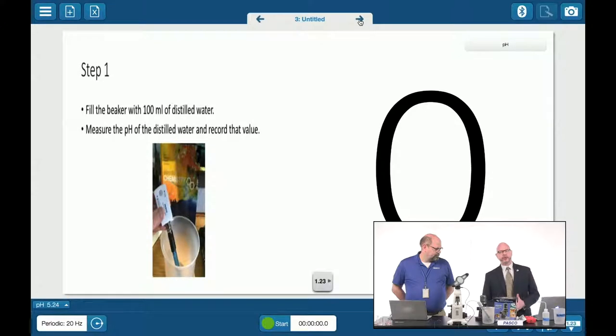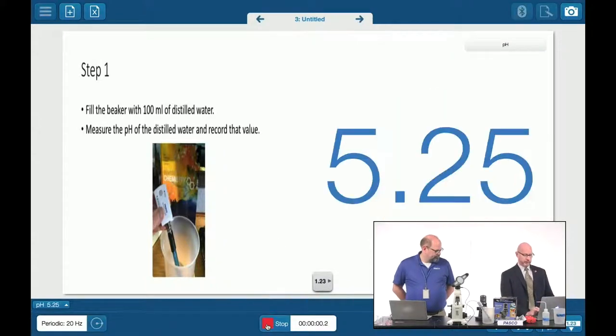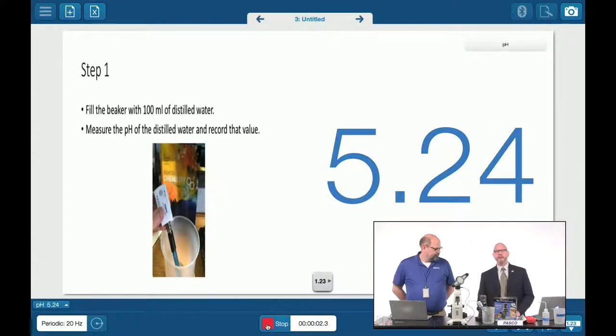And the next slide is already giving me some instructions to follow. It says, fill the beaker with 100 milliliters of distilled water, measure the pH. Well, I've already done that. I've got my water there, and all I have to do is click start. And here we go. Now I'm measuring the pH. I'm within the saved lab. I created it. I send it to my students. I've put a picture so they see what it looks like. You can see my picture. You see my instructions. I collect the data, and I stop.